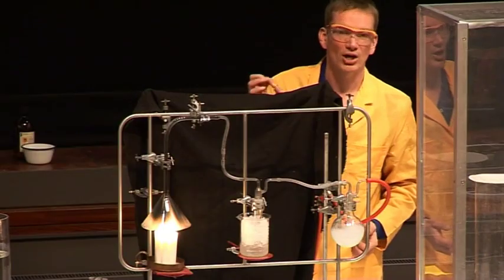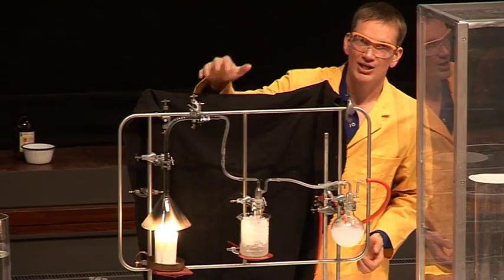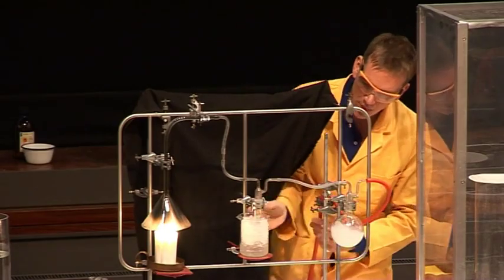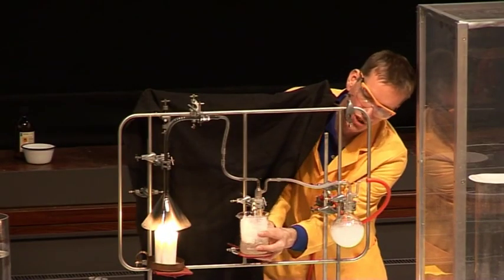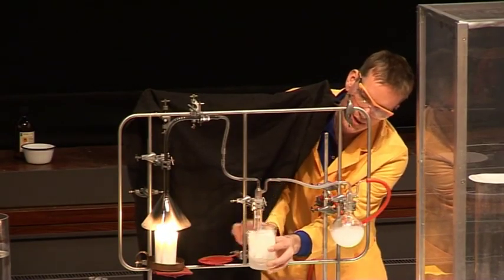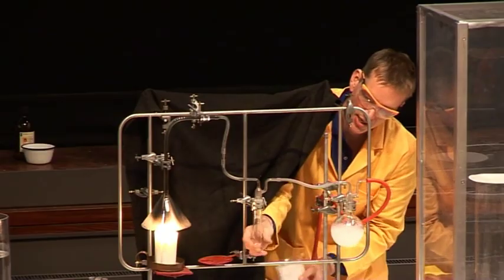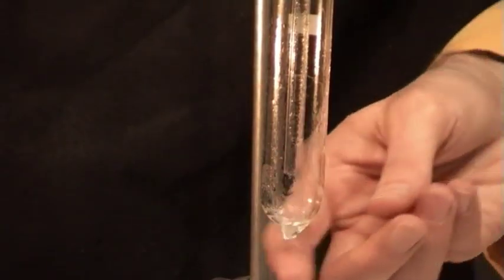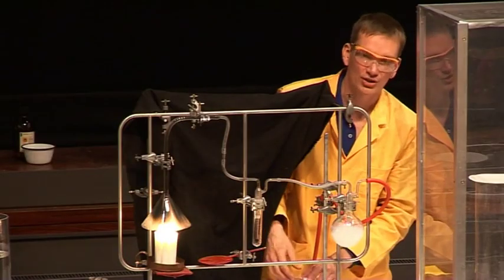So this is the carbon dioxide that's being given out as the hydrocarbons are burning. So the carbon in them is forming carbon dioxide. And if we look in the test tube, we might be able to see a few drops of water beginning to form. In fact, we can see there's a few drops in here and in the tube at the top and a little drop about to drip down, I think, into the bottom there. So water vapor is also being produced during this combustion.